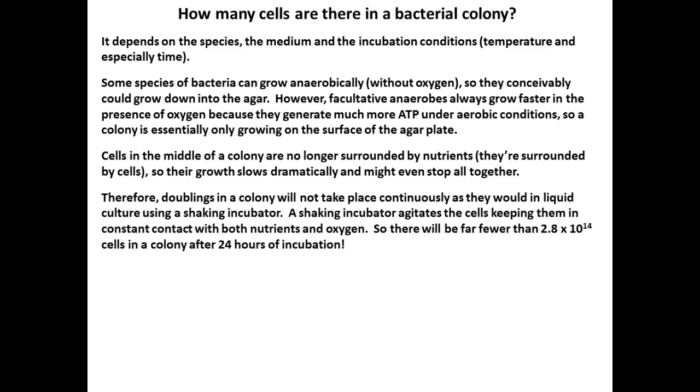So depending on the organism and its abilities, within the confines of that type of media, you'll see different growth patterns. One of the great things about the phenomenon that happened to us is that you can really see that's probably the newer growth on the edges of that colony. It's really kind of cool.